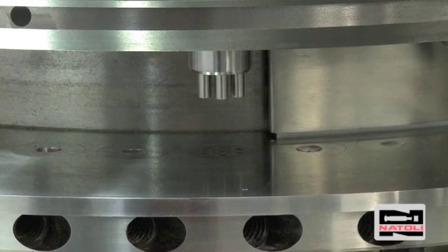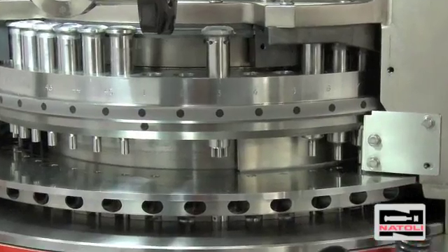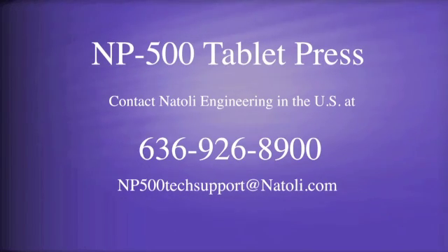You can move on to the next station. Today we showed you how to install tooling one station at a time. Generally, when you install tooling, you install all your dies, torque them down, then all your lower punches, and then all your upper punches. With practice, it can take approximately three to four hours to load a set of multi-tip tooling. Contact Natoli Engineering in the U.S. at 636-926-8900 or email np500techsupport@natoli.com.